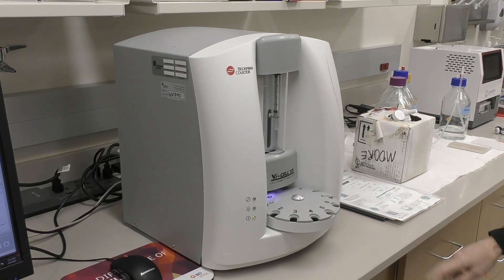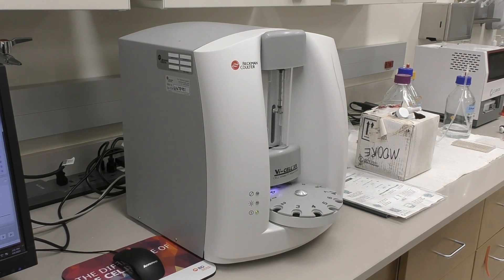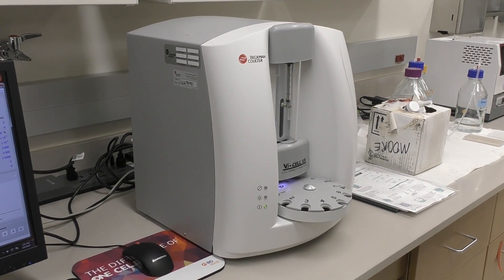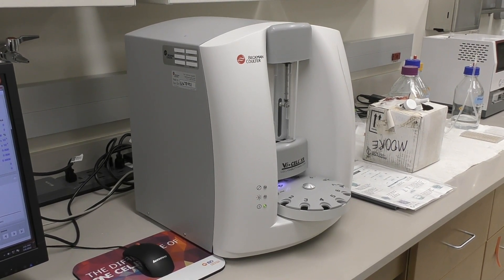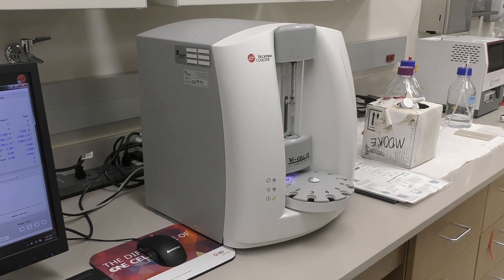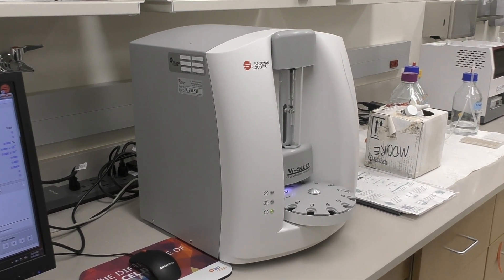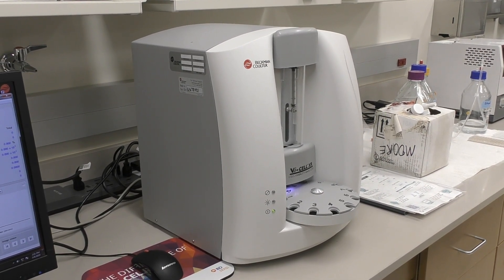This is the Beckman-Coulter ViCell XR Cell Viability Analyzer. It uses the Trypan Blue Exclusion Method and it is image-based. It takes up to 100 pictures and gives you cell concentration and viable cell concentration.